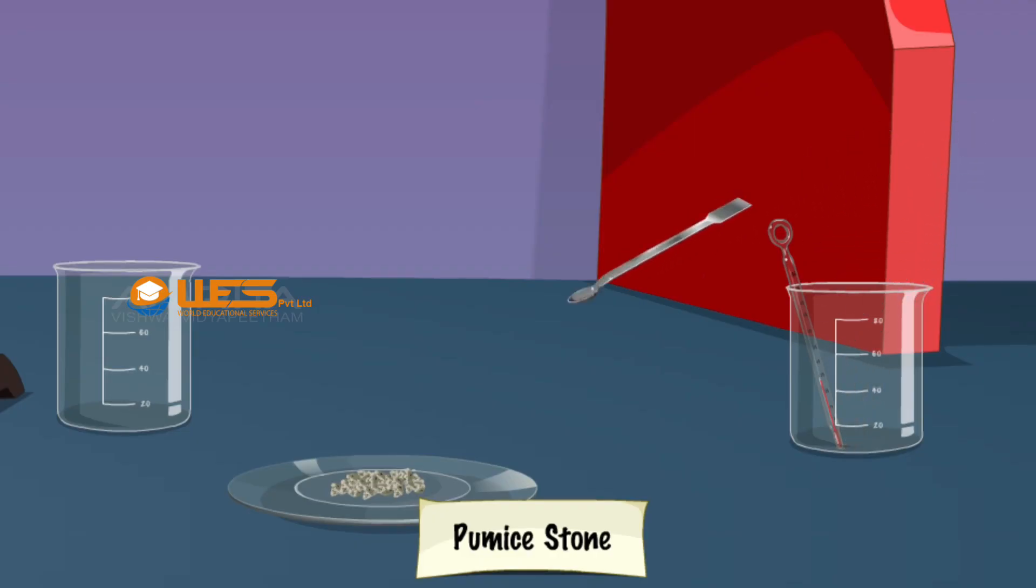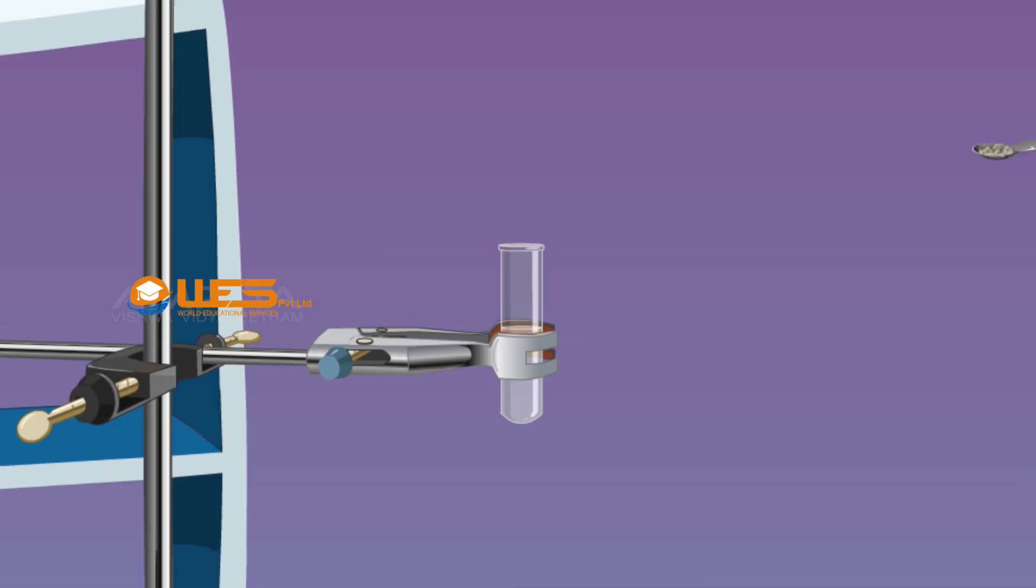Take a few pumice stones using a spatula. Put them into the boiling tube containing distilled water to avoid bumping while boiling.